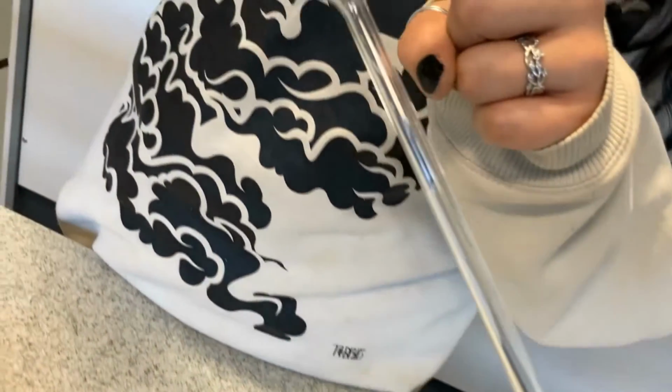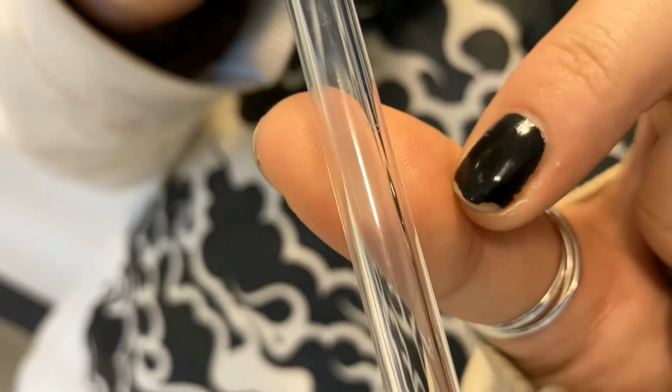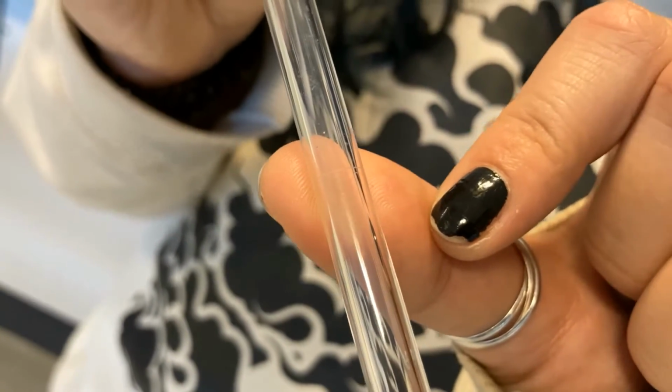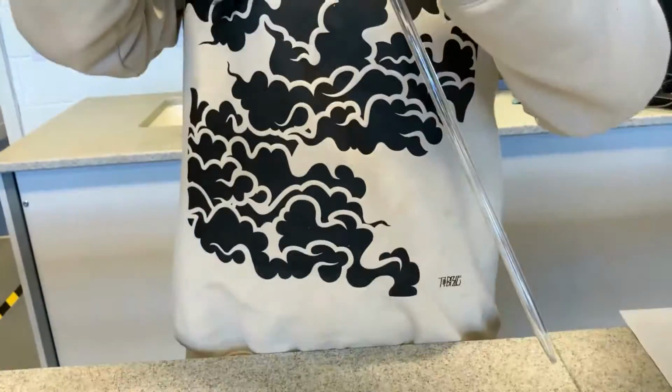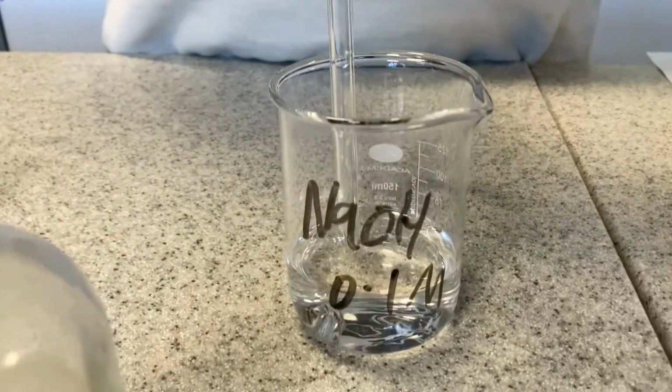And I'm going to suck up the sodium hydroxide all the way up here until it reaches this little really hard to see line, okay? And that will give me exactly 25 millilitres. Being exact is super important for titrations, okay? So I'm going to put it in.